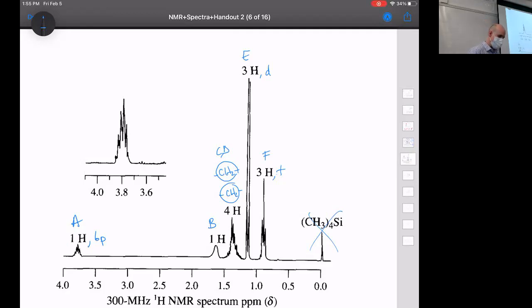Okay, in the middle. So what is normally on the outside, if that's your comfort zone? The outside is probably going to be CH3s, because CH3s are always going to be, if they exist, at the end of the chain. So the part of this that is the most central to the molecule would be something with a whole lot of splitting. And the thing with the most splitting is this environment A right here.